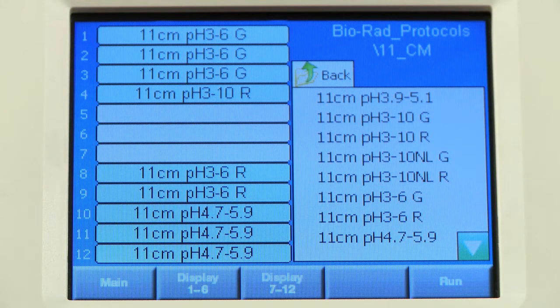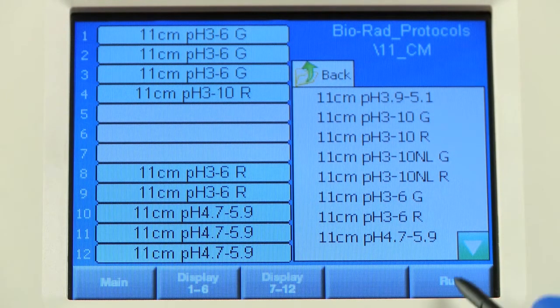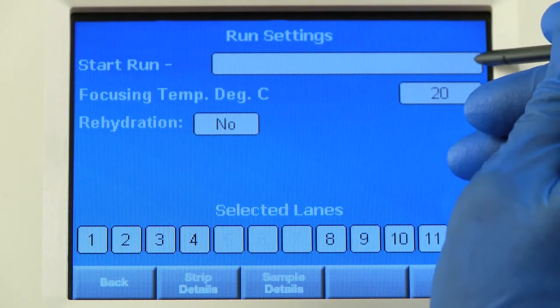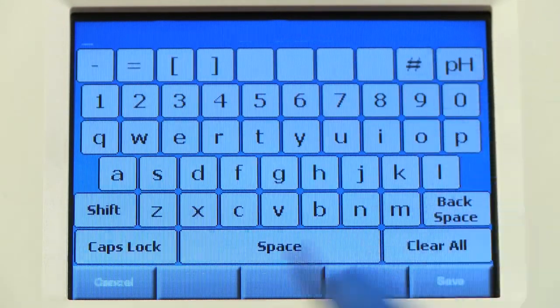When you are ready, press the Run button. You will be taken to the Run Settings screen.